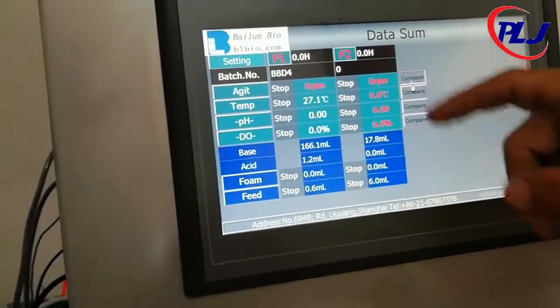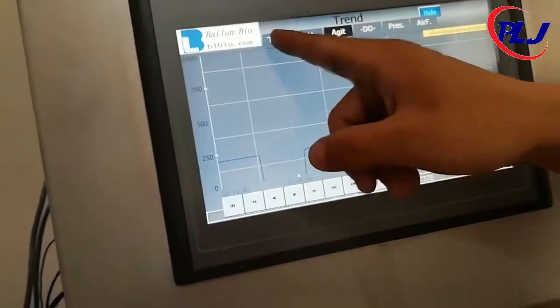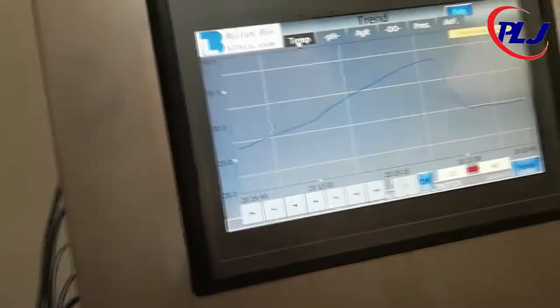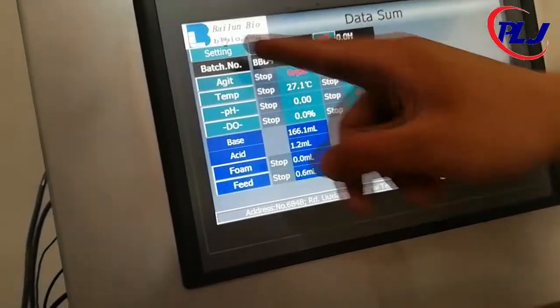For a graphical representation of the data, click the tank symbol F1 or F2, then click the pylon icon at the top left part of the screen. Then click the trend on the left side of the other parameters. A graph should appear on the screen.